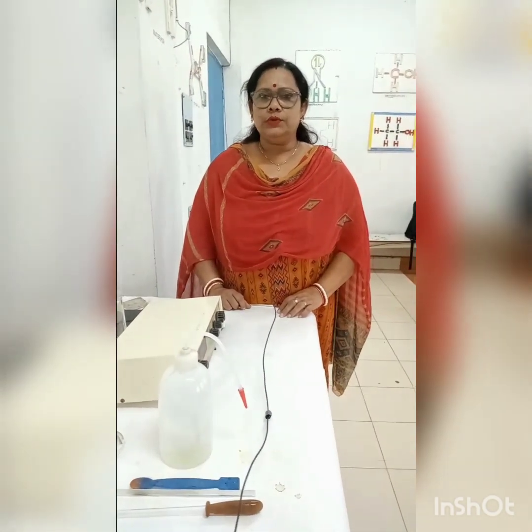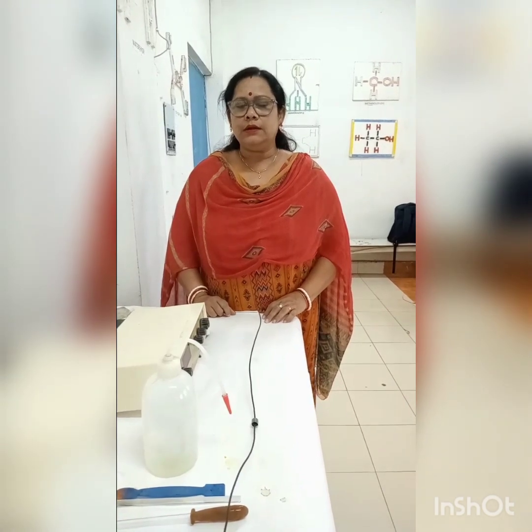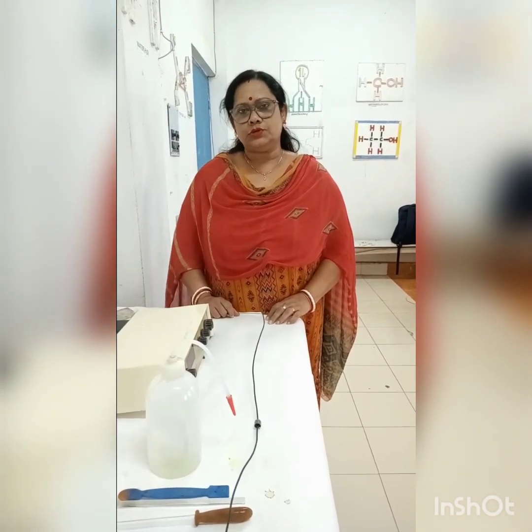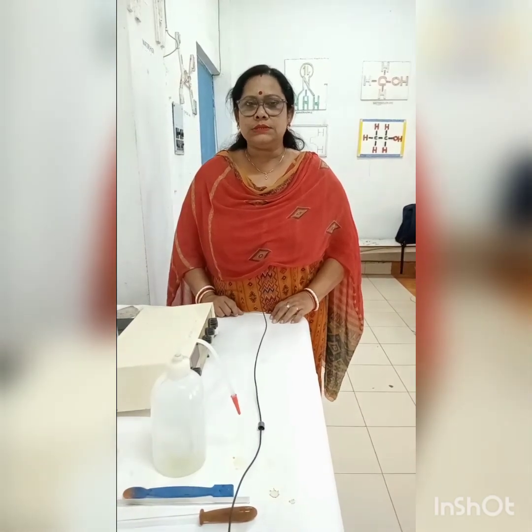Dear students, today we will see how to make standard potassium dichromate solution. The required apparatus and chemicals are as follows.